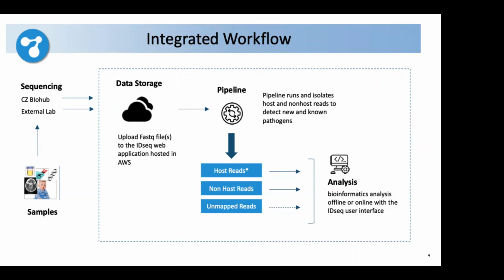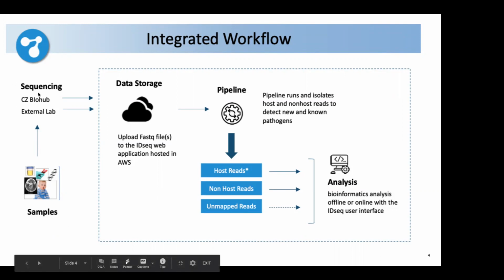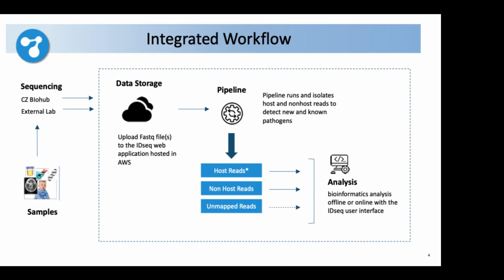Once you have a sample like blood or CSF, you can actually take that sample, bring it to a lab, and that's where the actual sequencing will begin. There's several library prep stages. We call this the wet lab portion of this entire workflow. When the samples have actually run through the sequencer itself, it typically outputs these data files in the format of FASTA or FASTQ files. And this is actually what you would end up uploading to IDseq. And this is where we really come in.